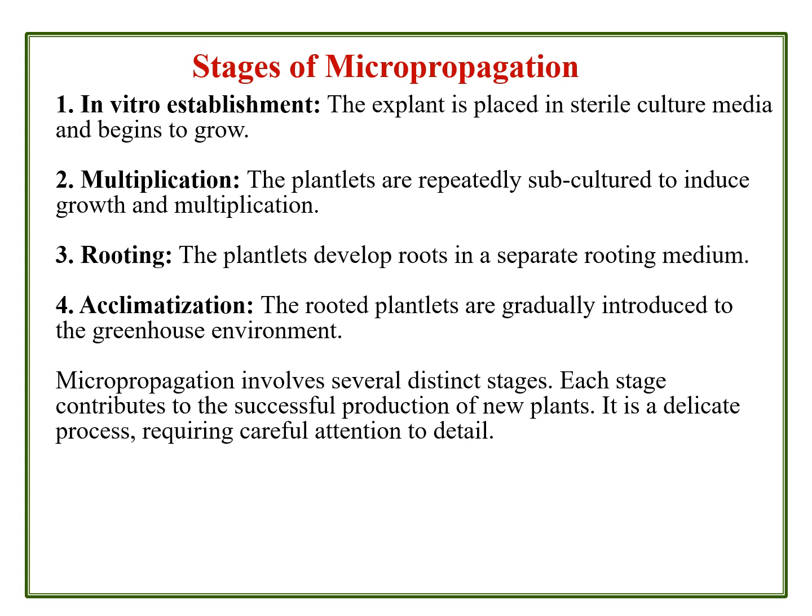After the plantlet has grown to a stage with root, stem, that is adventitious shoot, and a little bit of propagules, with leaf primordia obtained, then the plantlet should be acclimatized to the normal conditions. In this regard, the rooted plantlets are carefully and aseptically cut down.